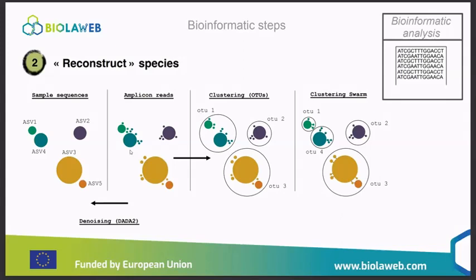You put the same position of each codon in the same column, and then you look if each sequence has the same nucleotide, and for a certain stretch you consider, okay, this species has two nucleotide differences. It's a way to calculate the distance between two sequences. So we talk about identity, but we could talk about genetic distance.